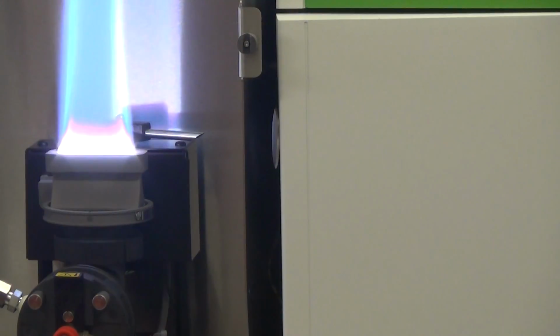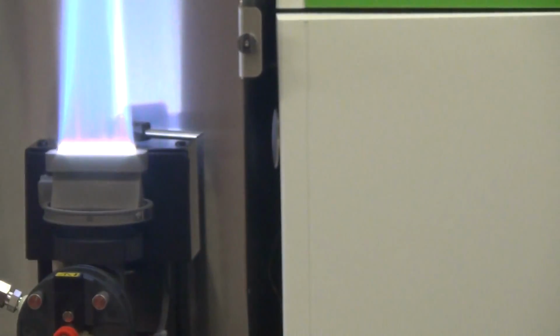Do I get maximum sensitivity? Yeah, it's fluctuating a lot. Plasmas and all flames do. I actually had to add more. Yeah, you cut it down. So, wow. You smell that? Yeah, so I'm getting back to there again, but what happens if I pull water out?